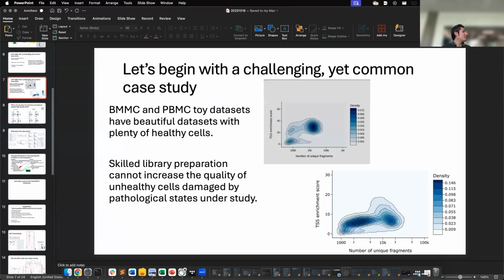So the clean data sets tend to look like this, and they just tell you to cut here and here, and obviously they're telling you to get this set of cells. But now you have me curious, what would happen if you isolated this and brought that through the pipeline? What does that actually look like? Presumably they're not good cells, but I don't actually know what it does look like. So yeah, lower quality cells.